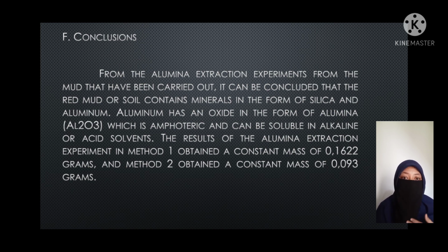The result of the alumina extraction experiment in method 1 obtained a constant mass of 0.1622 grams and method 2 obtained a constant mass of 0.093 grams.